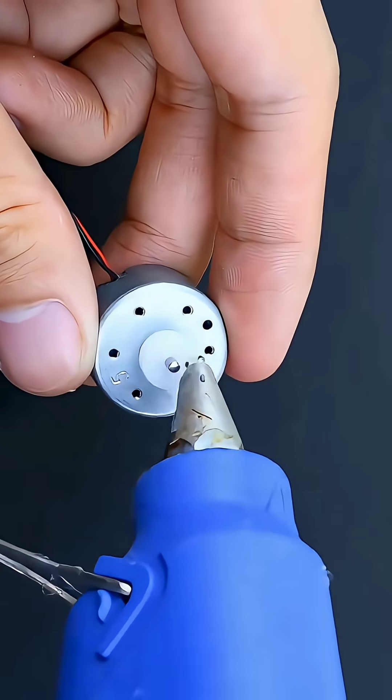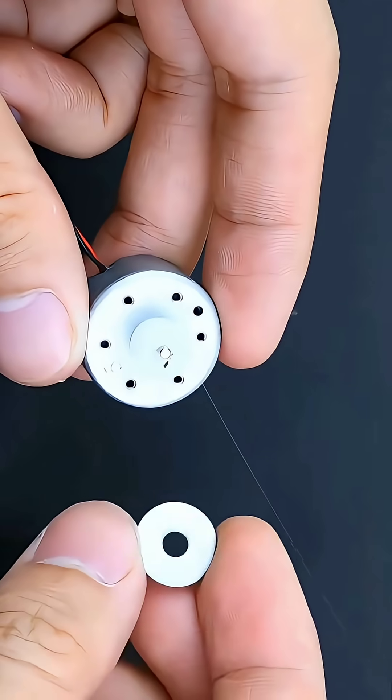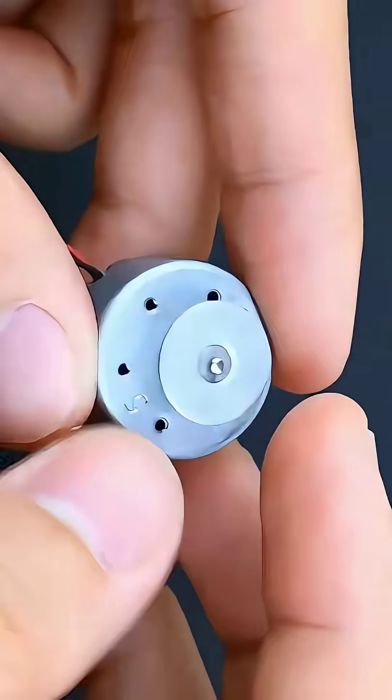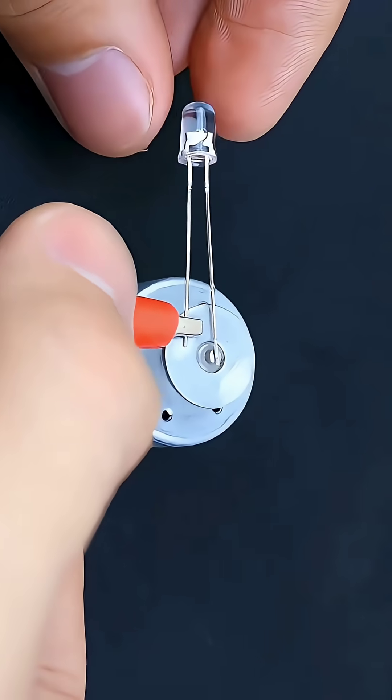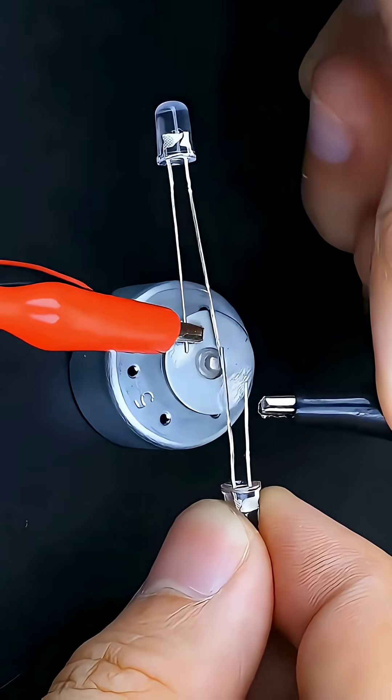Today in our class, we're performing a live DIY science experiment using simple materials. First, we carefully prepare the solution inside the beaker. Now watch closely as the reaction begins.